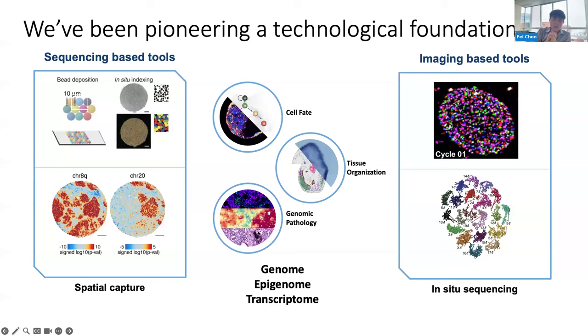And beyond just looking at counts, one thing we aspire to is actually to sequence, whether that's the genome, the epigenome, or the transcriptome. So far, we've been focusing mainly on tools that allow us to access sequence information. And so today I'll talk to you about a new technology we've developed for bridging the world of single cell and spatial.